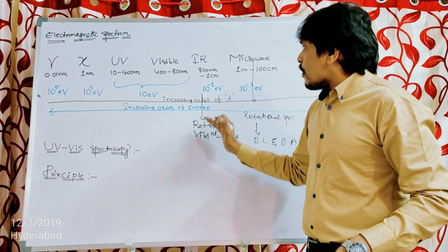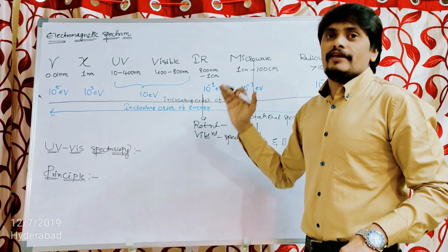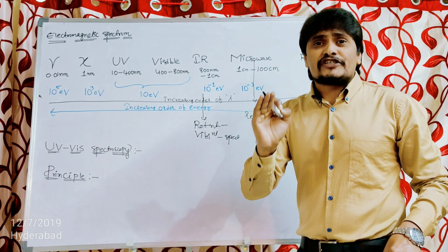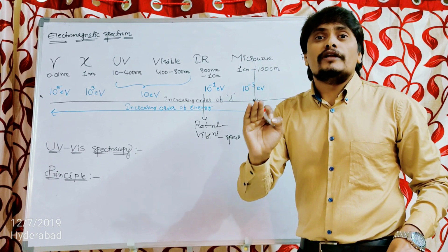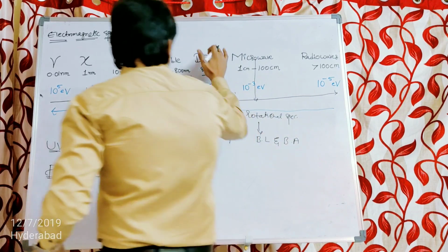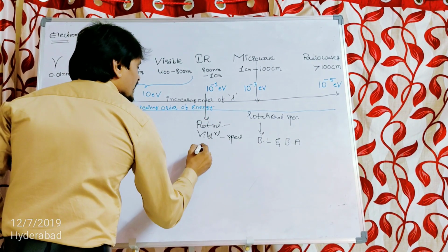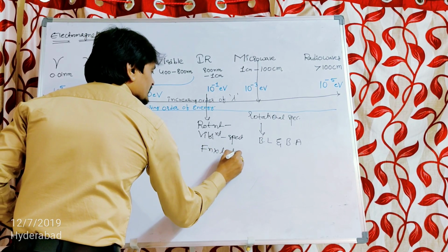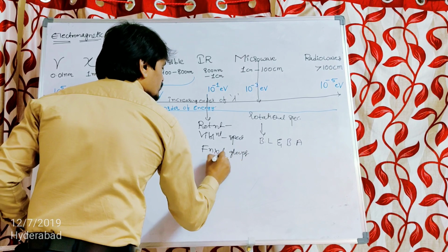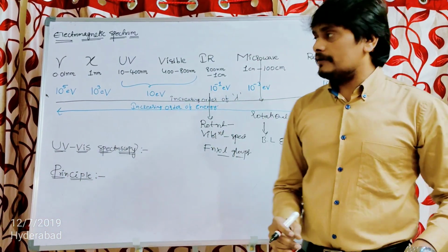And by means of this IR spectroscopy, we can know the information about the functional groups present in the molecule.